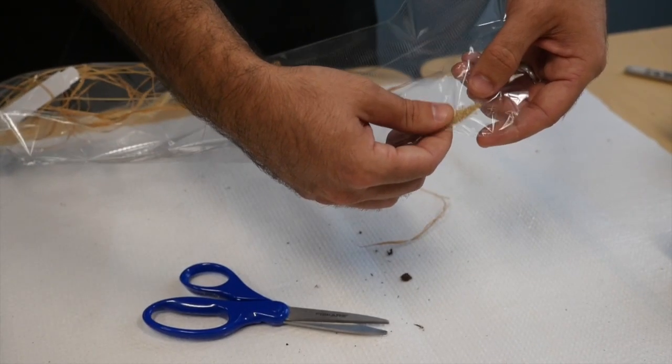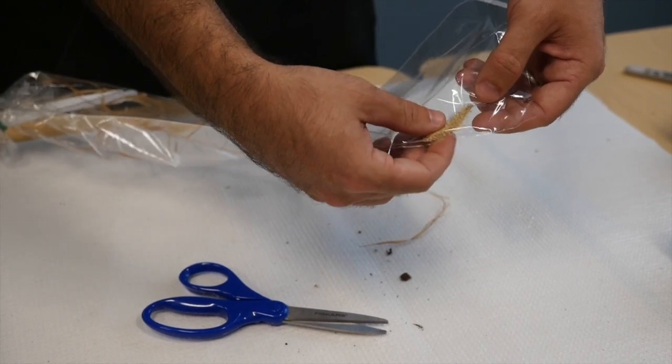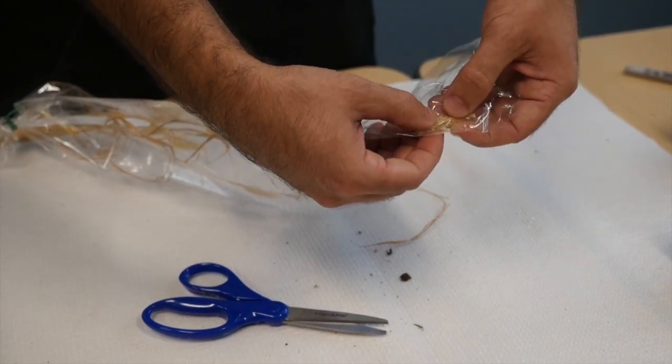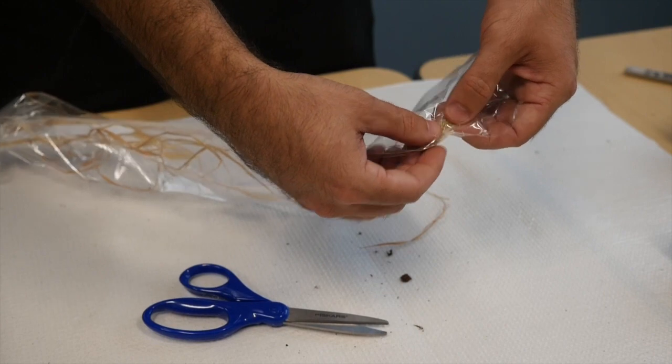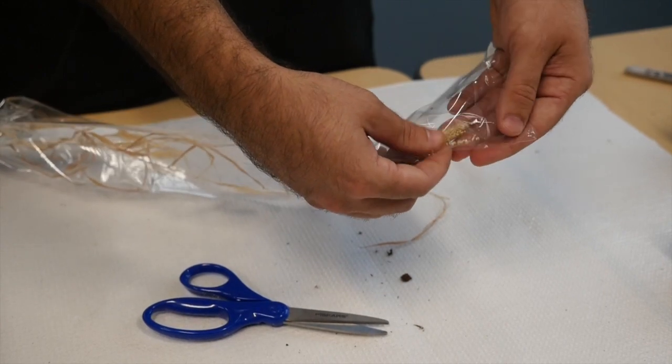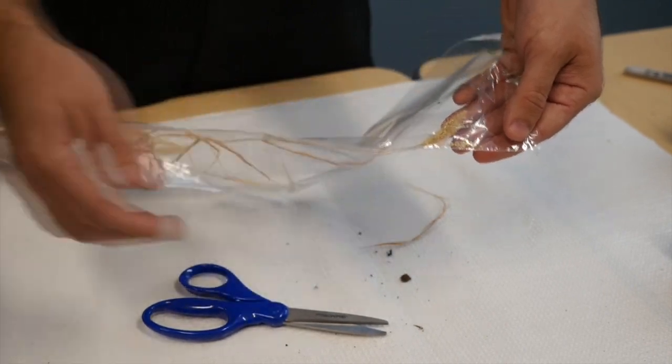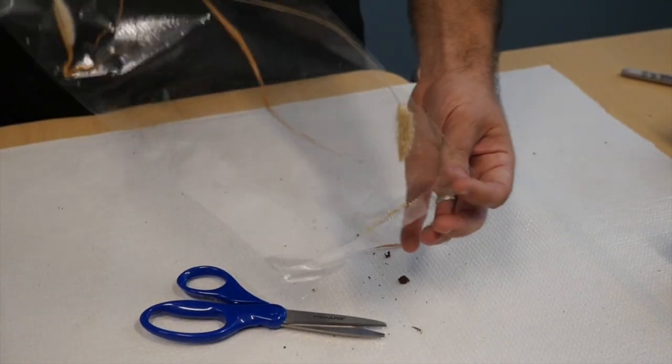All you have to do is slightly rub the panicle and the seeds will start to fall off as you can see there. Do that for every panicle.